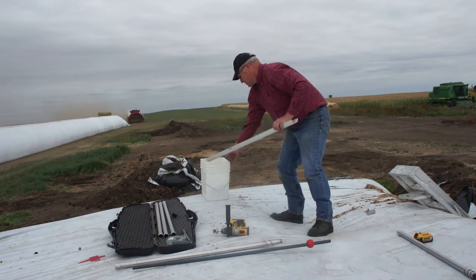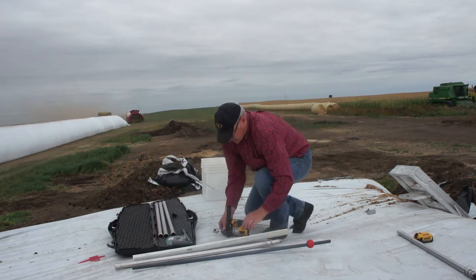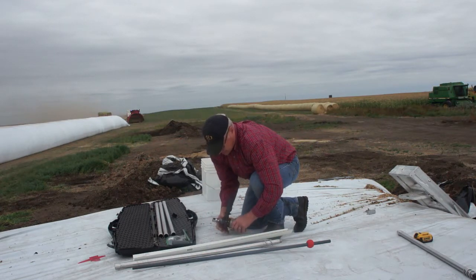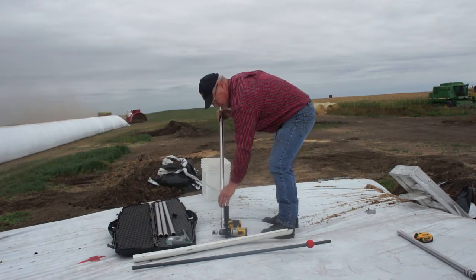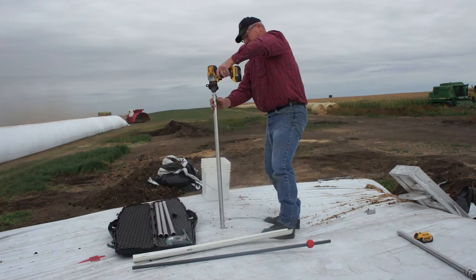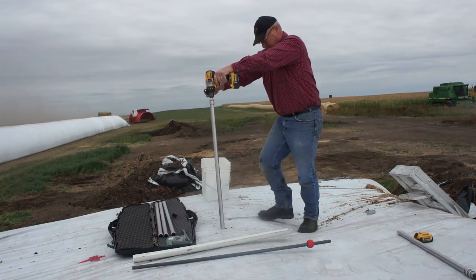We know that the farmer is removing that mold off the pile before he feeds it, so we're not going to include that in our sample for analysis, because the farmer normally removes it anyway. Then we'll go back in the same hole, add an extension, and get our second depth drill.